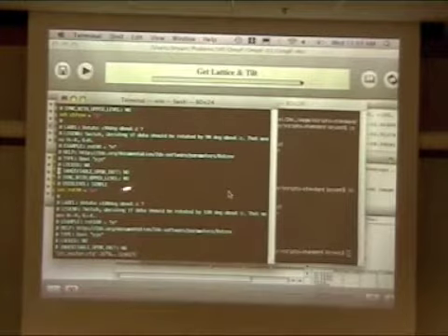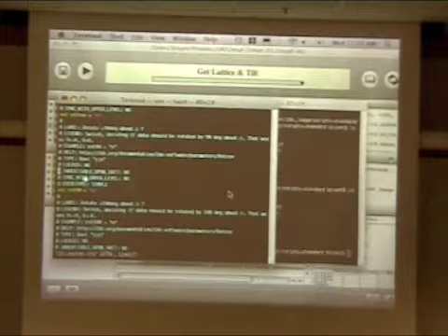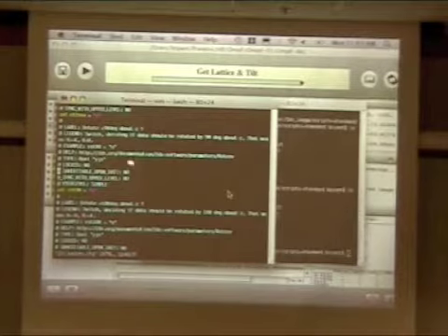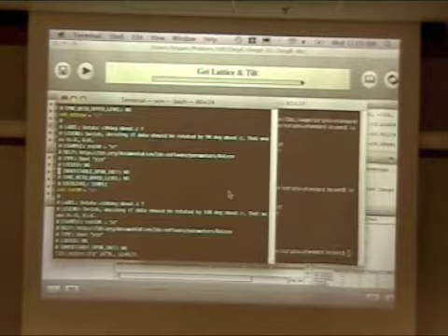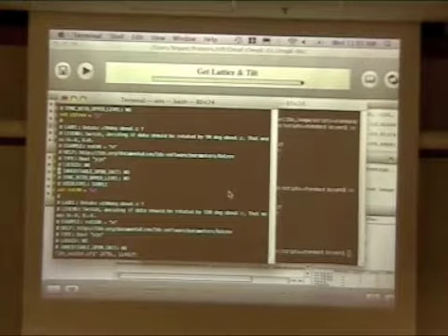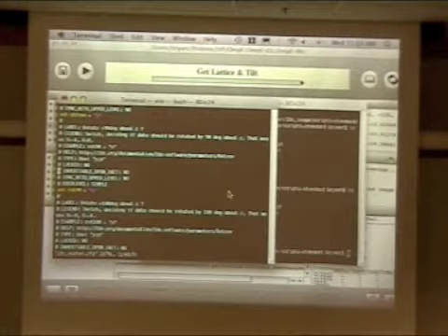We've got inheritable upon init and sync with upper level. This basically says when you import a project using 2DX merge, does this variable automatically get populated from the master configuration in the merge project, or does it get initialized from this global configuration? There's a sync with upper level that basically says some variables just don't change. You usually have a project-wide symmetry, for instance. You never want that to change on an image-by-image or even tilt range-by-tilt range basis. So this just allows you to define variables at one place and never again.